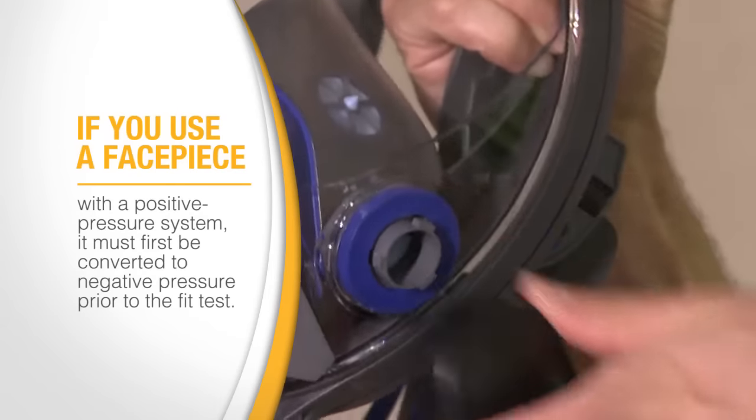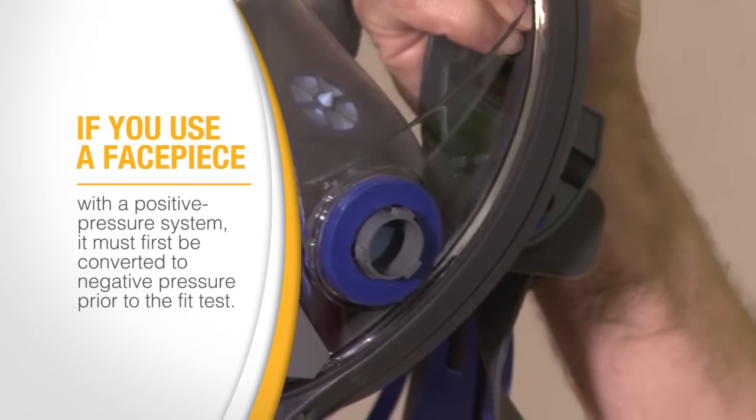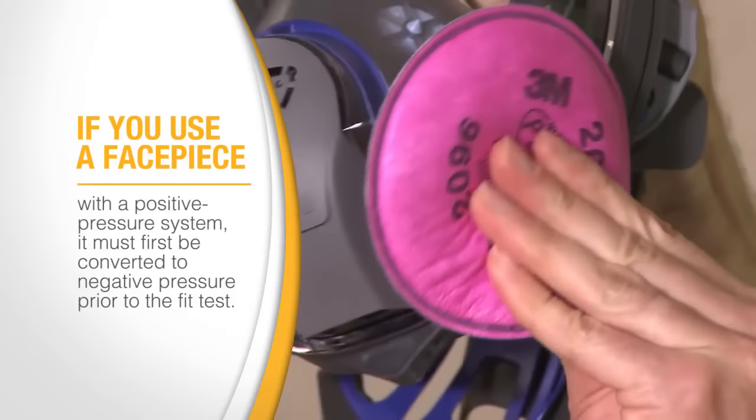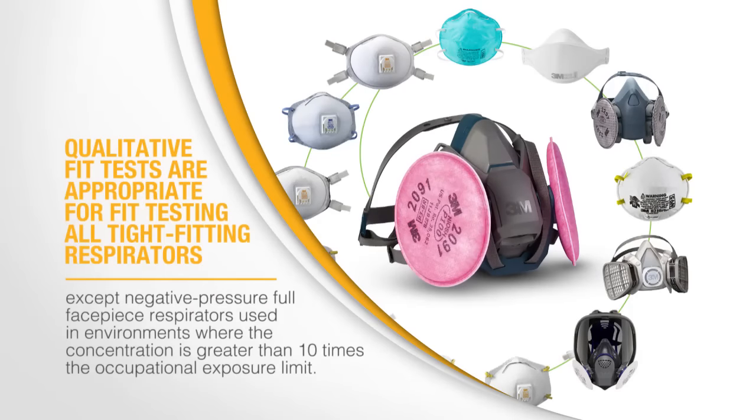If you use a facepiece with a positive pressure system, it must first be converted to negative pressure prior to fit test. Qualitative fit tests are appropriate for fit testing all tight-fitting respirators, except negative pressure full facepiece respirators used in environments where the concentration is greater than 10 times the occupational exposure limit.